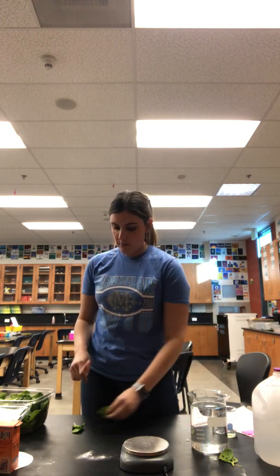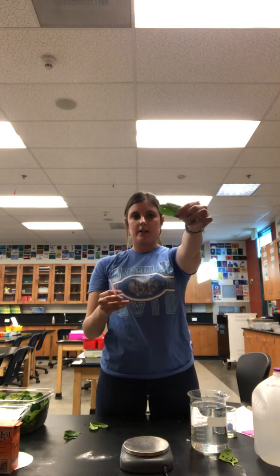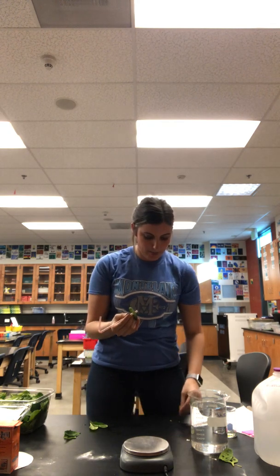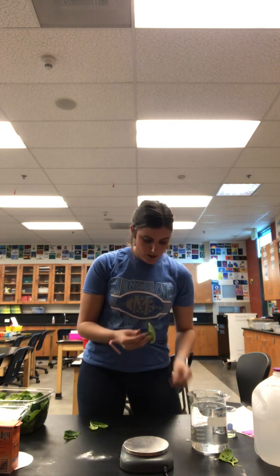Before we begin, we're all going to cut our leaves up. To do so, we're going to take our plastic straw and our spinach leaf, and poke holes through the leaf with that straw, which is going to make little circles or leaf chads. We want to get about 10 leaf chads per experiment, so 10 for the dark experiment and 10 for the light experiment. While I'm cutting these out, I'll explain a little bit more about the lab setup.